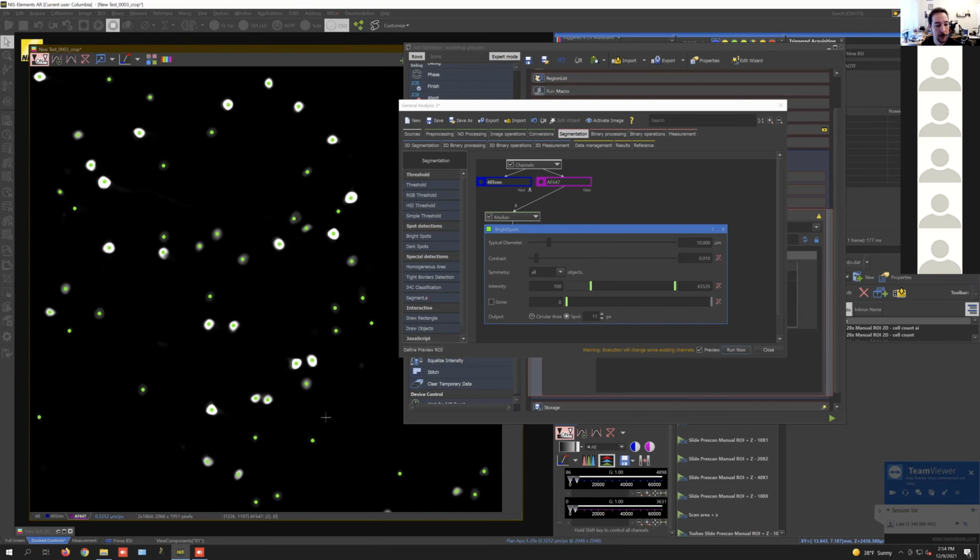So by hovering around, you can see all these pixels are basically zero. That's because we filtered the data and then we did background subtraction. The background is actually quite homogeneous, and the rolling ball filter has just removed that out of the image. And so we have a really nice high contrast, straight from zero into the cells. The far red there is around 3000 now, and out here it's like two or three, so very close to zero.